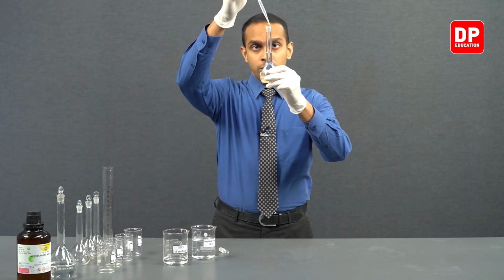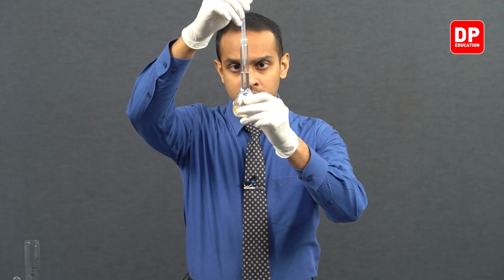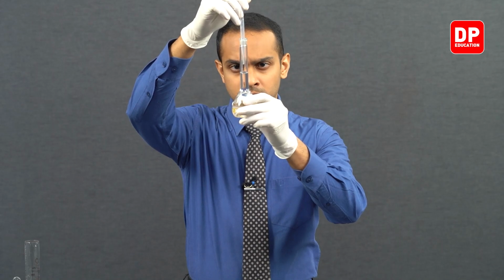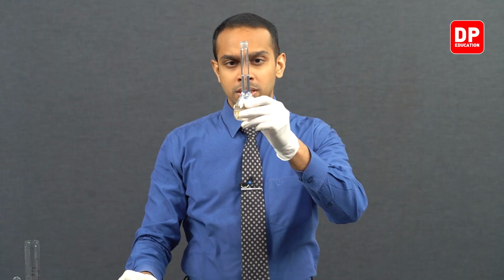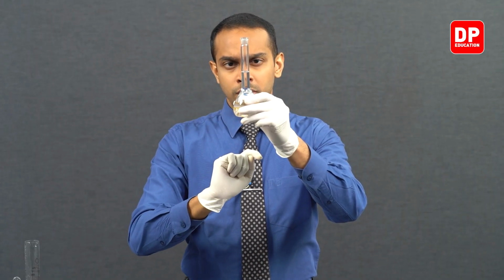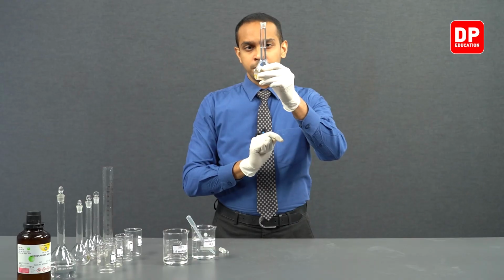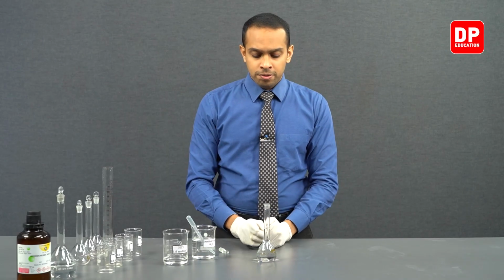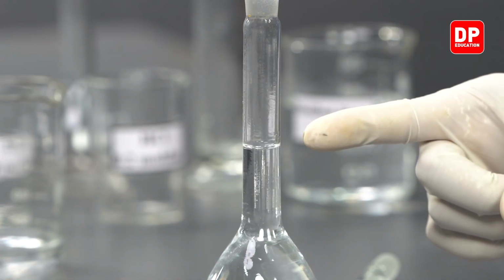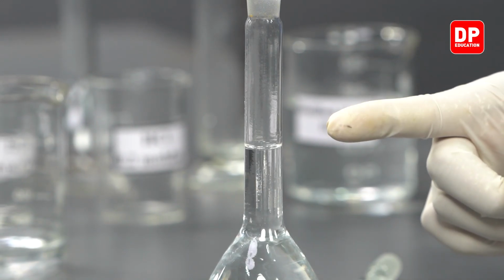So you will now bring it all the way up to your eye level and slowly add the last few drops of water until the meniscus perfectly aligns with the calibration line that you see over here. Now observe how the bottom of the meniscus aligns perfectly with our calibration mark.